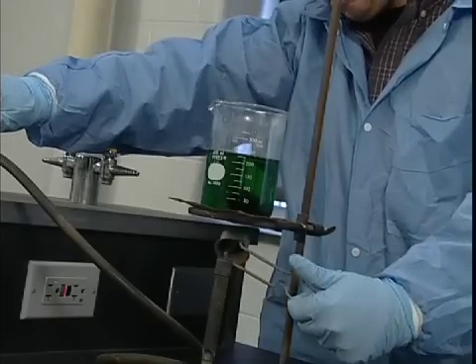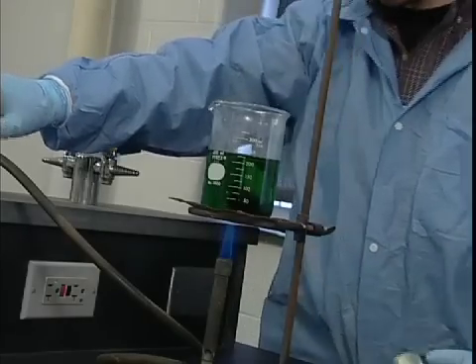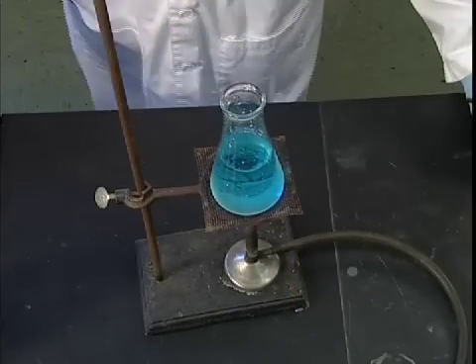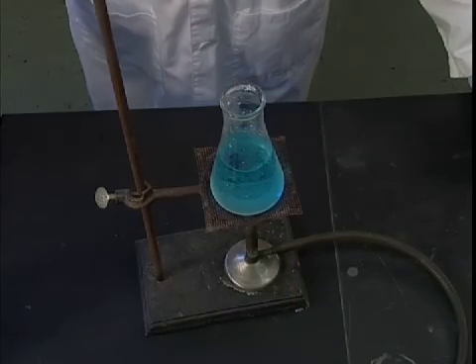In many procedures, glassware is heated to extreme temperatures. Inferior or flawed pieces can fracture or crack, showering the area with broken glass and hot chemicals.